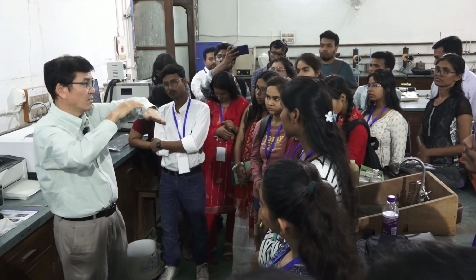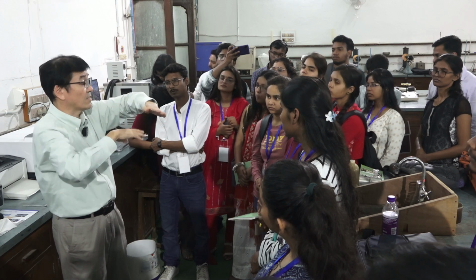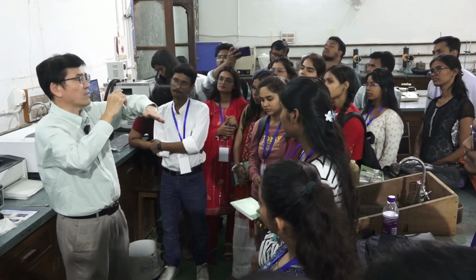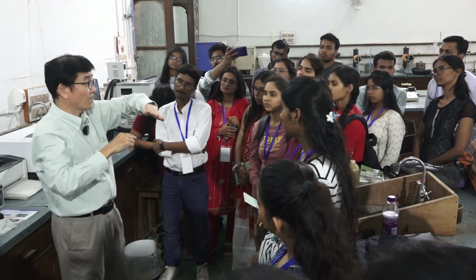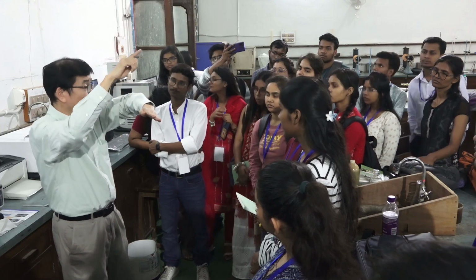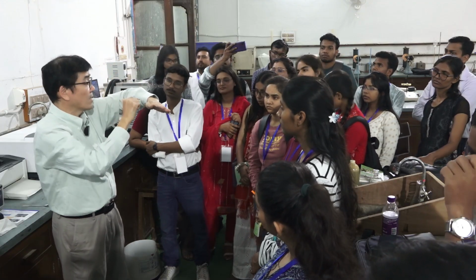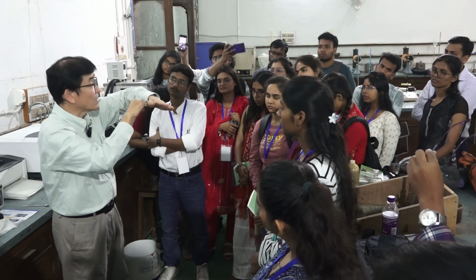It occurs only when the refractive index of material 1 is larger than material 2. Germanium's refractive index, I'm not sure of the value, but air is 1.0. And this is larger, so total reflection occurs. Then energy goes in this direction, but at this point an evanescent wave is generated.